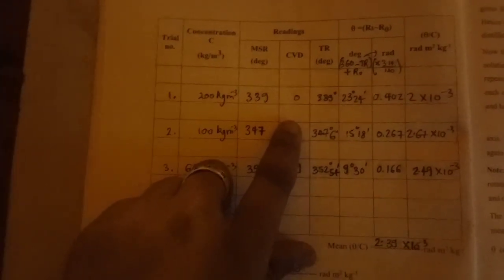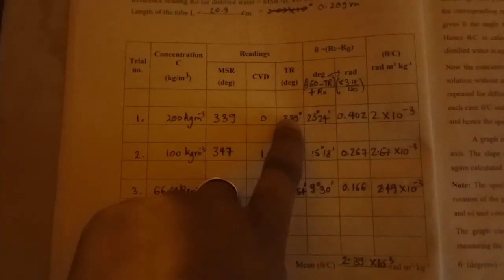When I did the experiment, for the first reading, since the concentration increased from 0, which was distilled water, to 200 for the first sugar solution, because the concentration is increasing, you have to rotate anti-clockwise to take the first reading. When you rotate the dial until you get equal intensity, you have to note down the main scale reading, the same way as we did for R0. You note it in theta in degrees, and now you have to find R1 minus R0. R0 was our reference value.